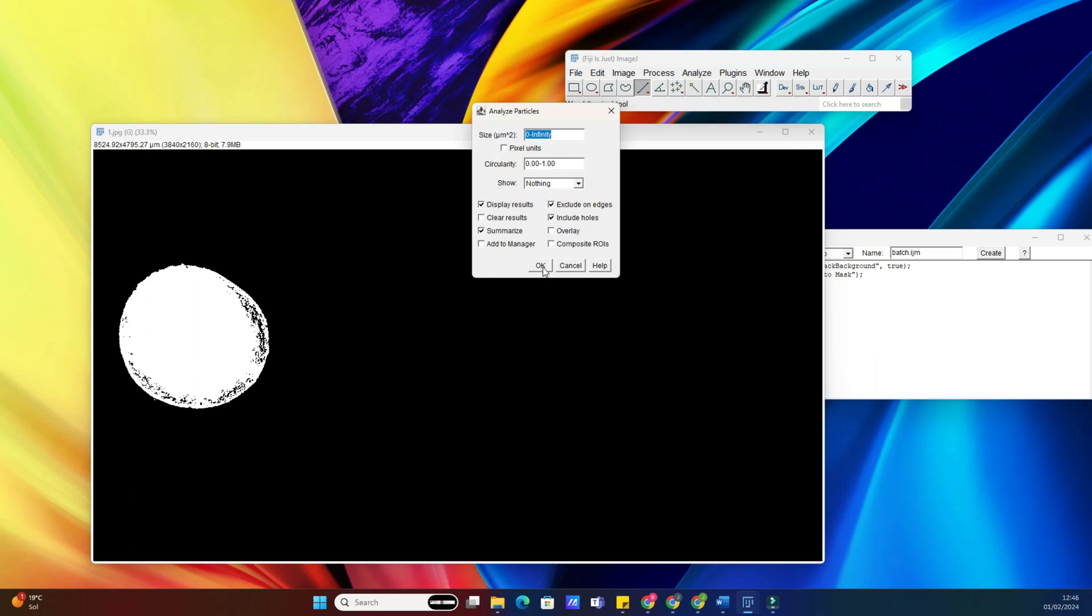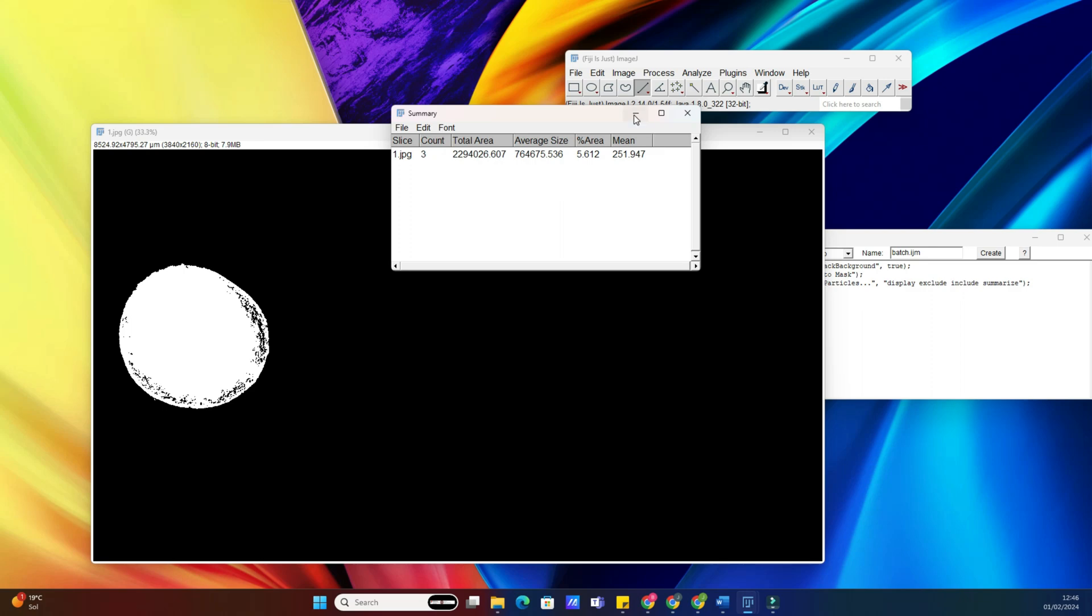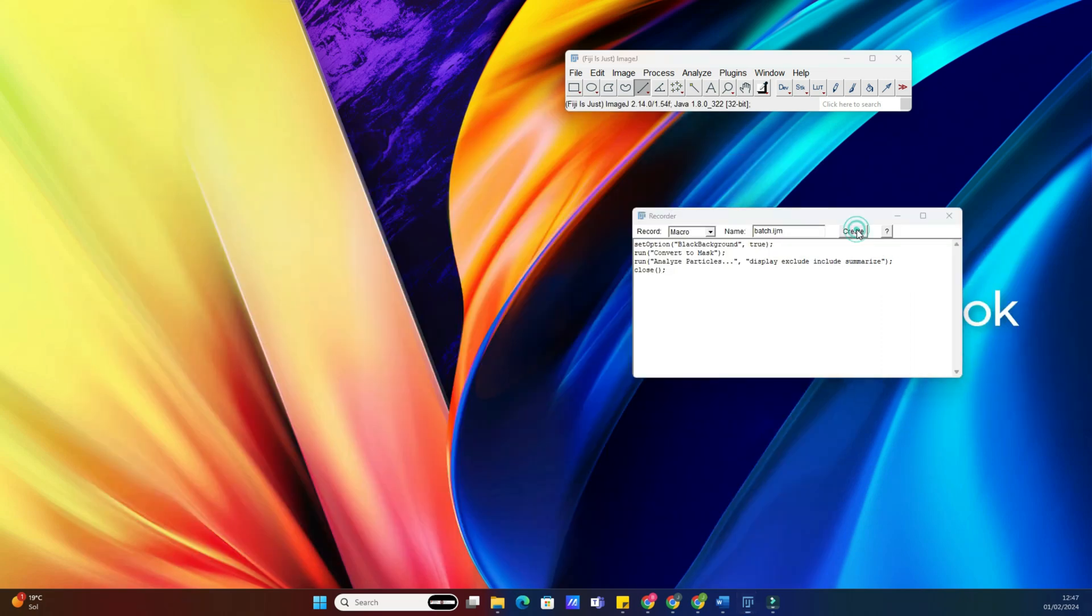Now that we have our macro recorded, let's apply it to the entire batch. Go to Process, Batch, Macro. Choose your recorded macro, set the input and output directories, and hit Process.